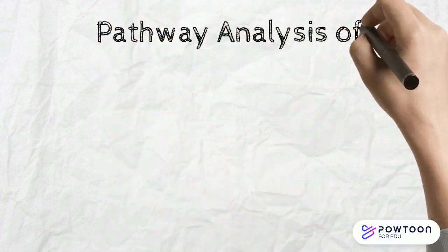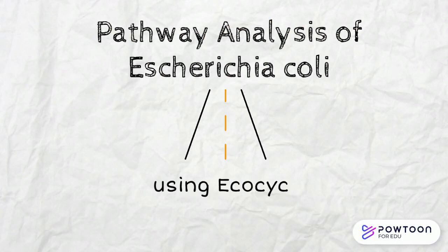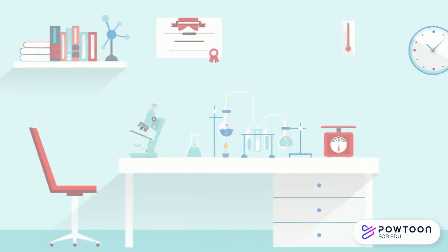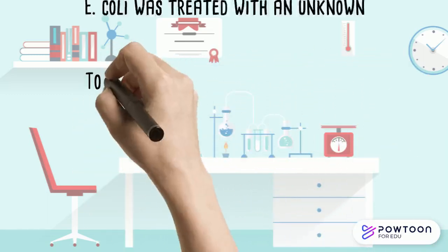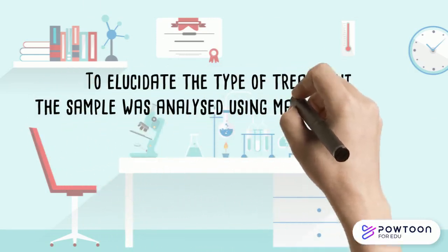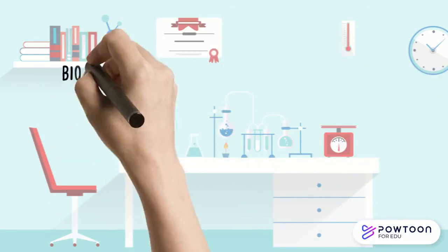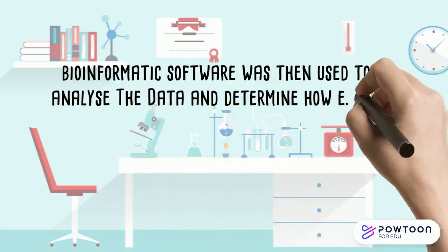Hi, today we're going to be talking about how Ecocyc can be used to determine an unknown treatment used on Escherichia coli. So, E. coli was treated with an unknown. To elucidate the type of treatment, the sample was analysed using mass spectrometry. The resulting data was then subjected to bioinformatic analysis to establish how the bacteria responded to the treatment.